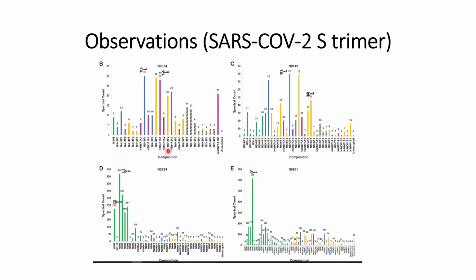They found that these different kinds of glycans can be found at this site. However, the most abundant ones are this one and these three, and it depends on what kind of analysis one is doing. But we can see that the most abundant glycans are 30, 29, 28.